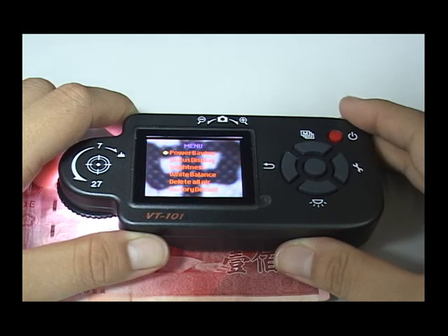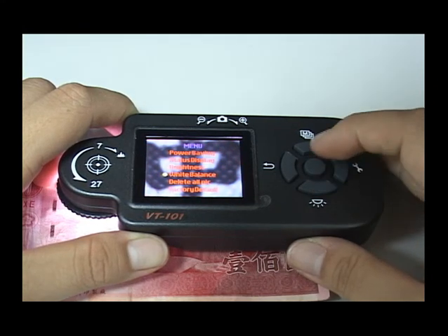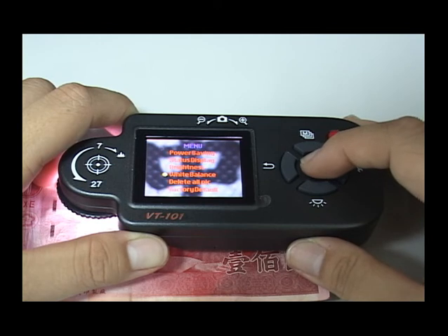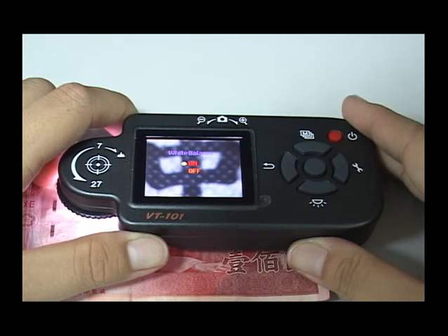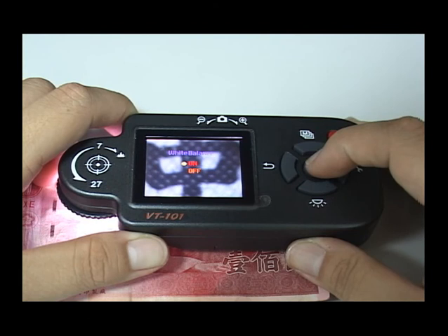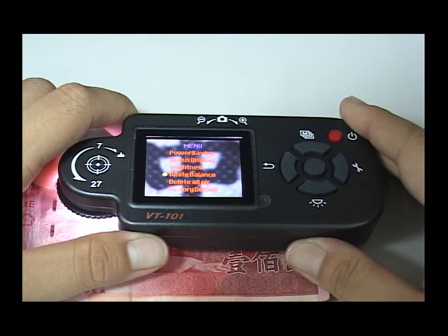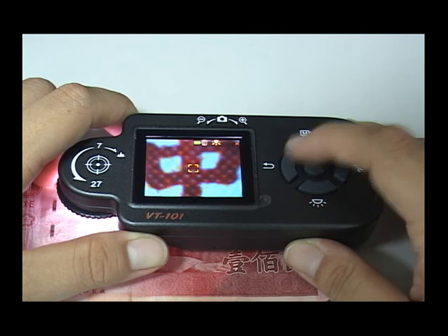There is a white balance function. When the user observes things, it will automatically adjust the brightness and contrast to improve image clarity. However, it may lose the real color. If you close the white balance function, you can see the better true color.